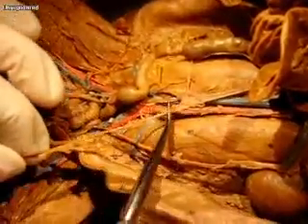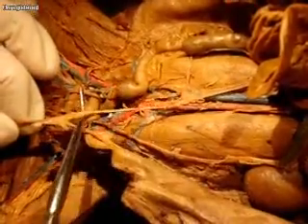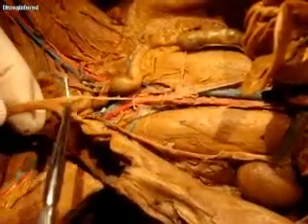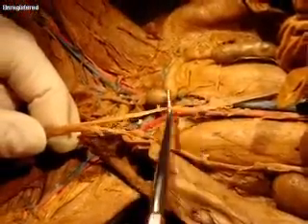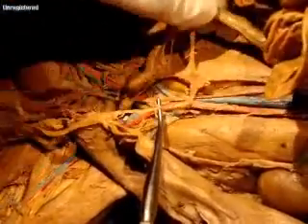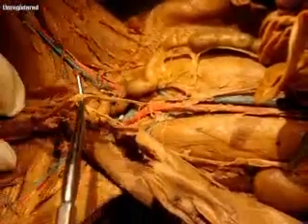Also broken off. Here is your gonadal artery, and this is then called a testicular artery in the male. So it's right here, and yeah, it's right here.